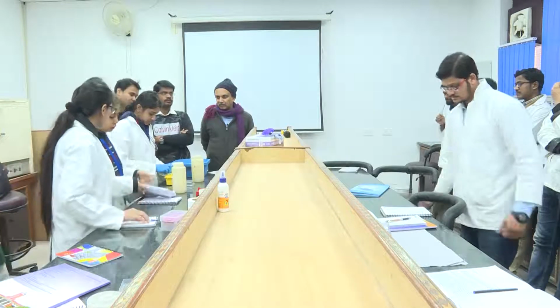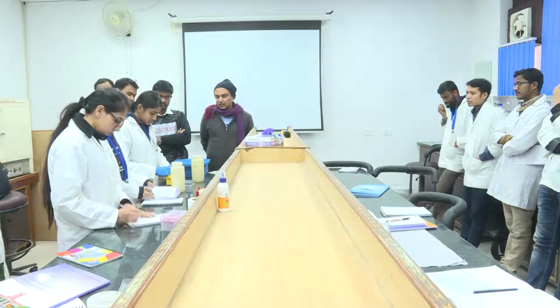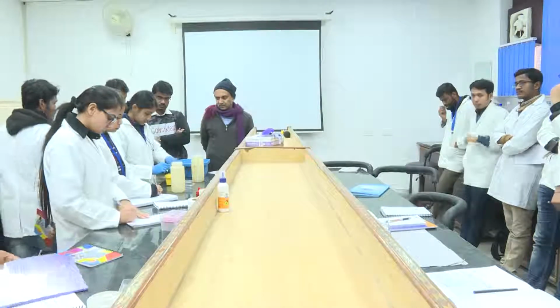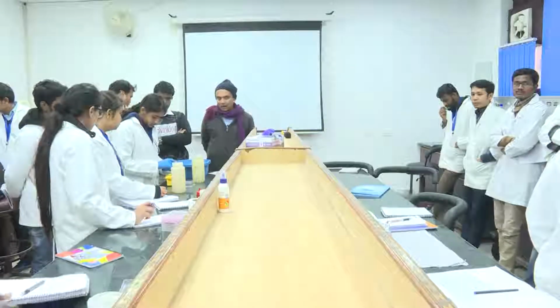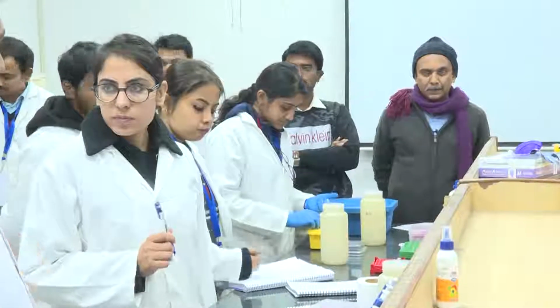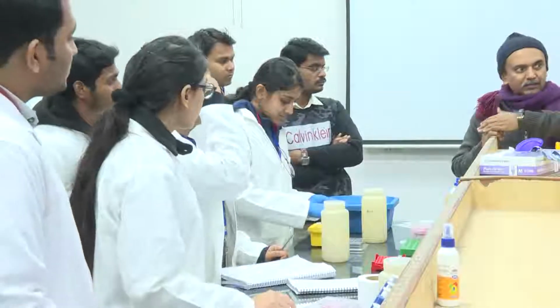You note down the number and order so that you know which environmental sample you are going to use for each group. Okay, for those who want to do it, let them do it.